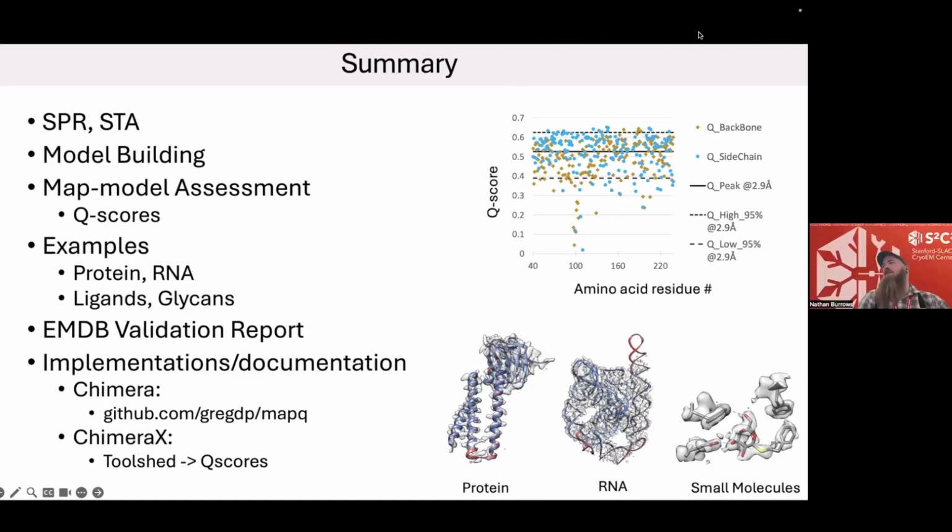So we have one question so far. To make sure everyone sees this as I was going to ask: how do you obtain a map with the Q-score values being used to map the colors on the map? How do you switch the color scheme being used to be based on the Q-score value? Ah, okay, the color scheme. Yeah, that's a very good question.